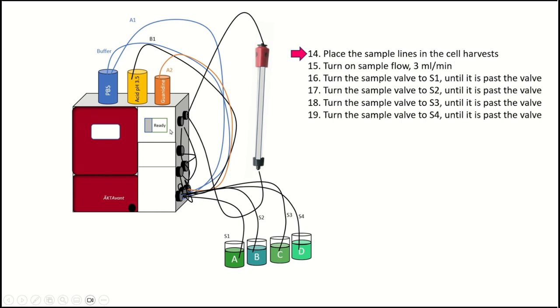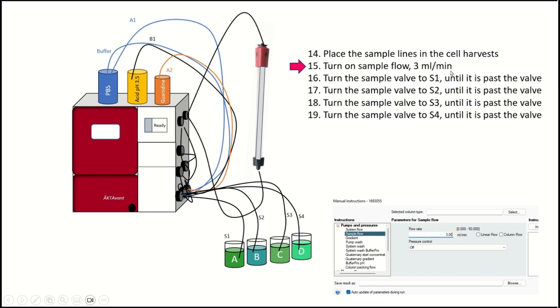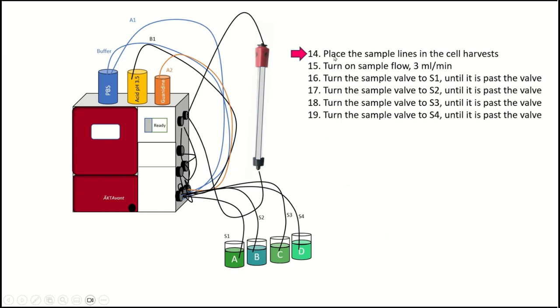Okay. So next we're kind of coming to the end here. So we're going to place the sample lines in each of the cell harvests now that we have them filtered, right? We're going to turn on the sample flow. I like doing something like three mils a minute. If you do one mil a minute, you can do that, but it's going to just take forever. You want to do something close to the sample flow rate.